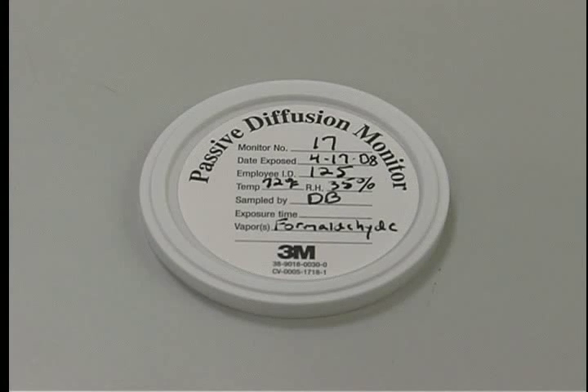Before monitoring with the 3M3721 Passive Organic Vapor Monitor, record the monitor's serial number, date, sample ID, temperature and relative humidity on the can lid. The exposure time will be the total amount of sample time to be determined at the end of sampling, and the vapors will be formaldehyde.